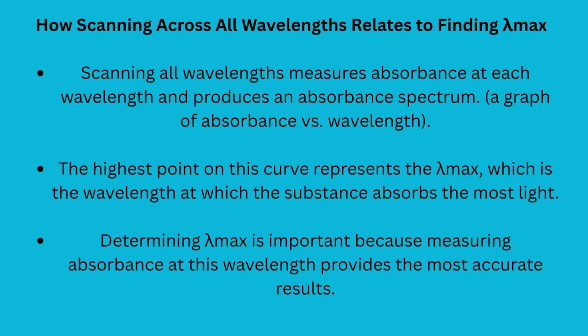The highest point on this curve represents the lambda max, which is the wavelength at which the substance absorbs the most light. Determining lambda max is important because measuring absorbance at this wavelength provides the most accurate results.